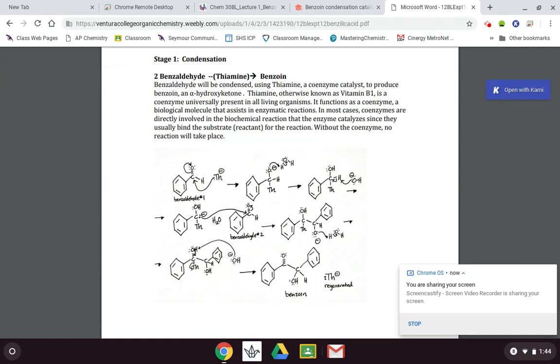And then that's not it. We're going to take that container and put it in the fume hood, and we're going to let that sit until next week. So, you know, it's going to be a long lab period, but you're not really going to be doing anything. Then you'll collect your material the following week, keep a little portion of it out, and let it dry so you can get the melting point of that compound.